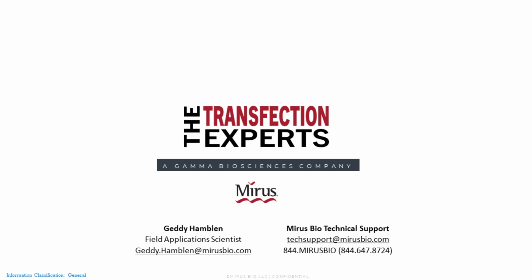The last question for the webcast is, is a media change required with VirusGen pre or post-transfection? No. Like many Mirus reagents, we do not suggest performing a media change pre or post-transfection. You might need to dilute your cells down to a specific cell density, but after adding VirusGen, you do not need to do a media change.